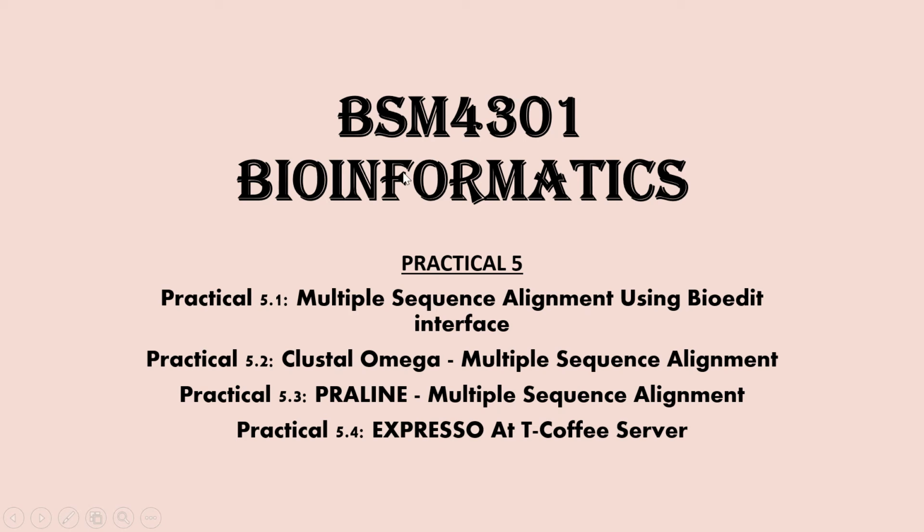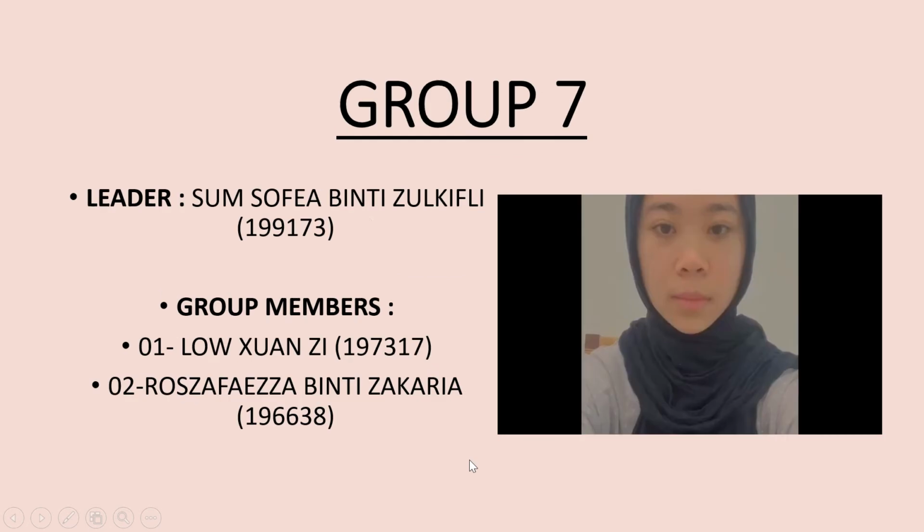Assalamualaikum and hi, this is BSM 4301 Bioinformatics. Today I'm going to present to you practical 5. We have practical 5.1 multiple sequence alignment using BioEdit interface, practical 5.2 Clustal Omega multiple sequence alignment, practical 5.3 PRALINE multiple sequence alignment, and practical 5.4 T-Coffee server.